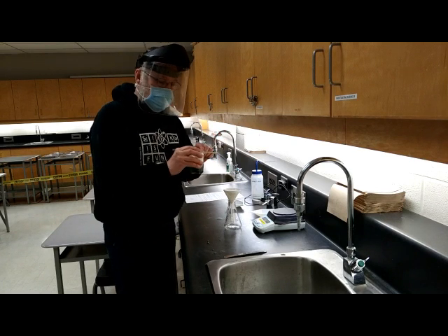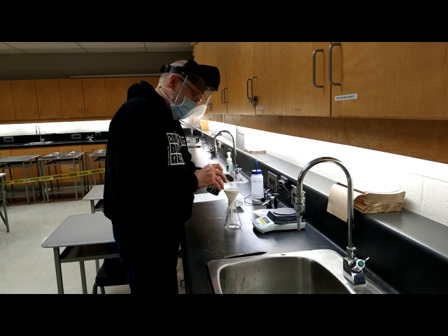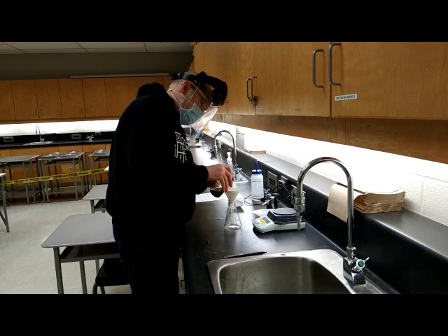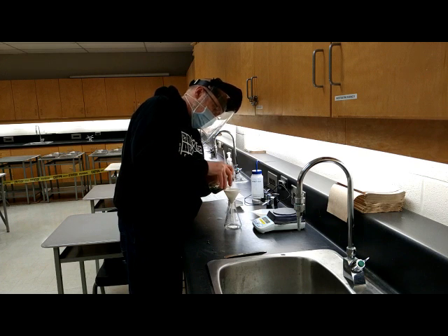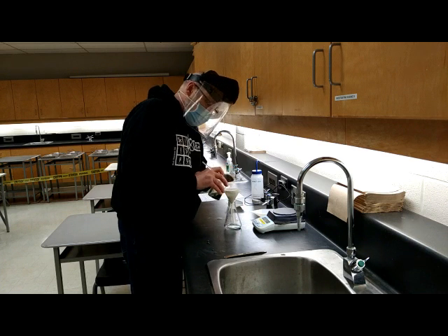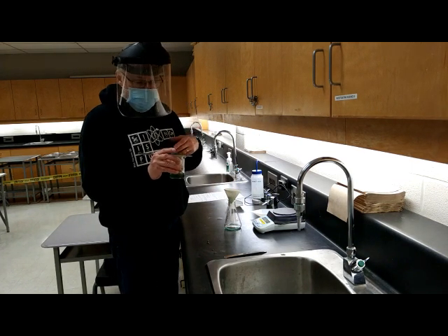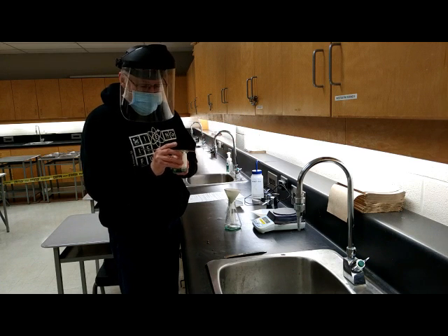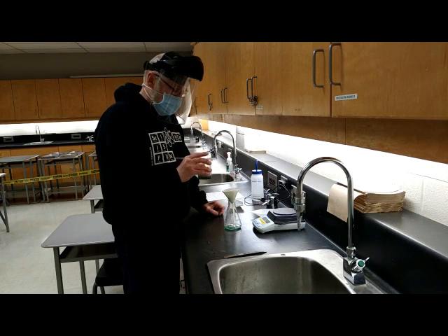And for this technique, what you do is you rest your glass rod on the top like this, and then you pour the solution into your container. And so very gently pouring off the liquid without losing any of the solid. Now I'm doing this into my filter paper because I want to be able to actually retrieve as much as possible. Now the problem with this is that if it's a small powdered solid precipitate rather than a kind of a gel precipitate that adheres to itself and sticks together, the small bits quite often get lost in this process. And so you have a tendency to lose some material that way. So that's decanting.